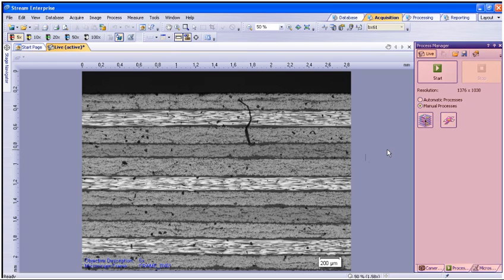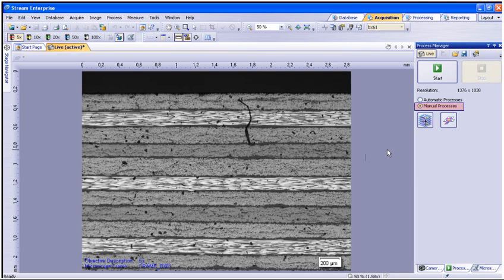You will interface with the Process Manager tool window. Make sure to select Manual Processes. Within the manual processes are Instant EFI, Extended Focal Imaging, and Manual MIA, Multiple Image Alignment.